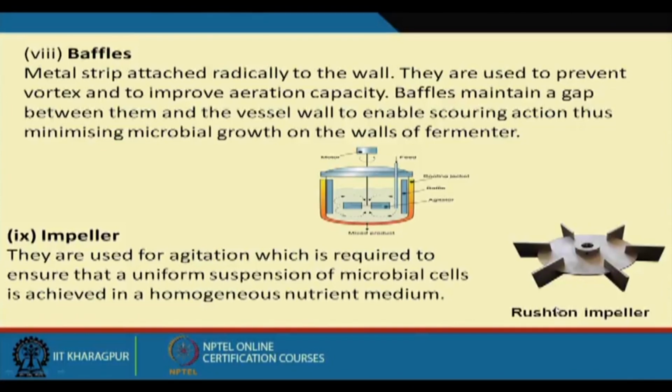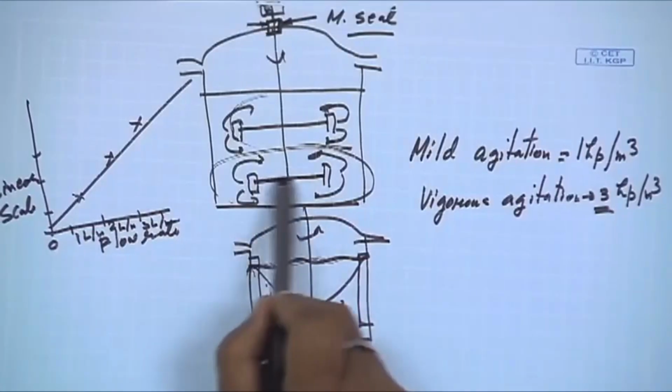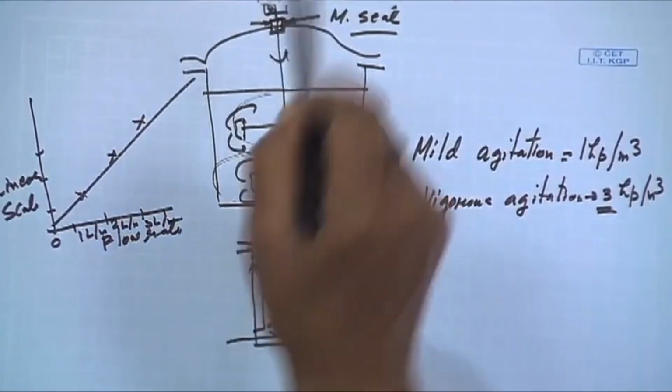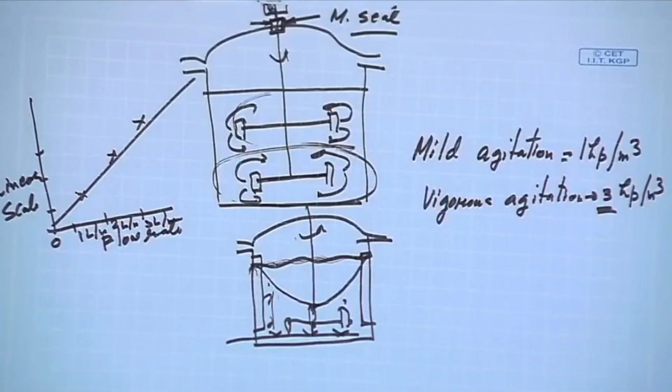When I worked with industry, I found that we have to keep the impellers, that is the blades, at different levels, because if the height is more, then you have more impellers across the shaft. We have to fix so many impellers on the shaft.